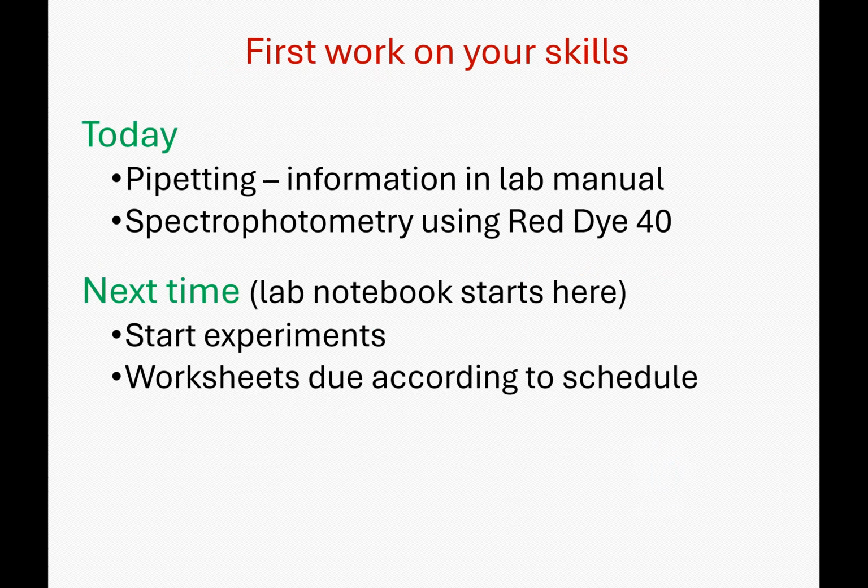What you're going to do today is first work on your skills. Some of you are good at pipetting, some are not. Pay attention and learn to pipette. If you want to get out of the lab faster, pipette well. I will make you stay and redo it until you get good lab results or until class period is over. If you pipette well, you'll finish sooner.